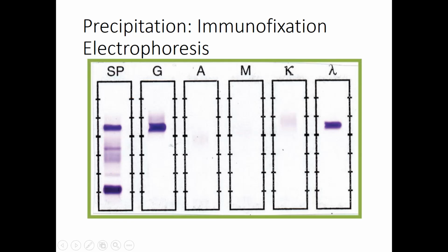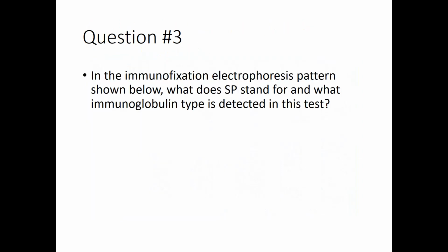This is sort of our control here. We saw no dye forming here. This is a little background noise. There might be a little something there, but not most of it. So again, instead of applying it to a trough as we did before, we apply it across the whole gel in 6 different lanes. And we'll look and see what the reaction is. It doesn't take long. It takes only about an hour because we're using electrophoresis, so it's much faster, and it's very specific.